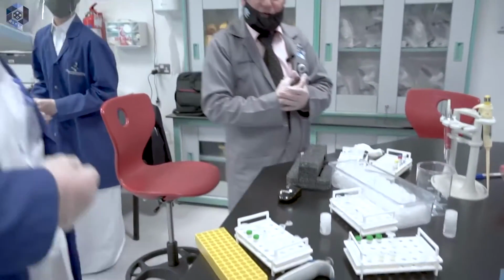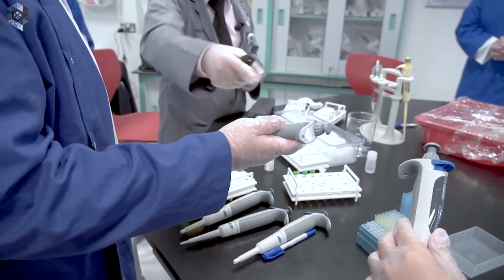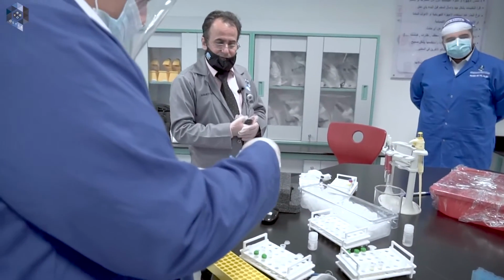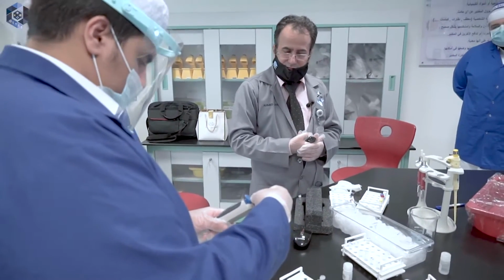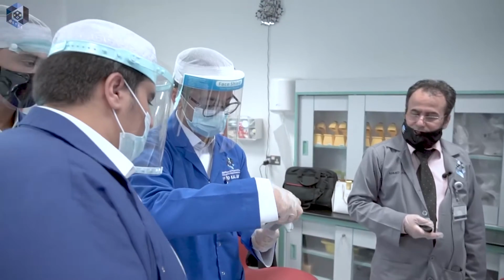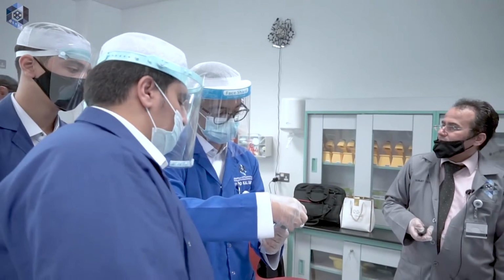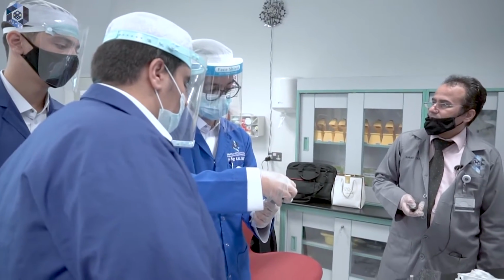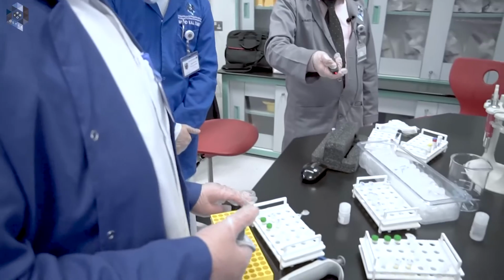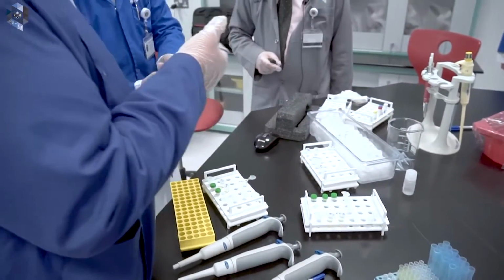45 microliters. Which micropipette are you going to use? This one. Why this one? What is the maximum? Okay, this is 50. Now make it 45. Take a yellow tip. Now, open the distilled water.